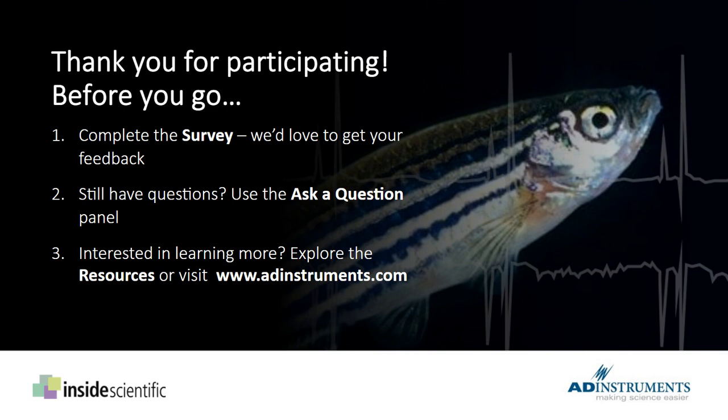Oh, great question. I love it. We have an MI model, the myocardial infarction model by cryoablation. This model has been established for zebrafish. And when we cryoablated a little bit, when the student does a little bit too much ablation, there are some fish that actually suffer sudden cardiac death on follow-up at day 1 or day 2.